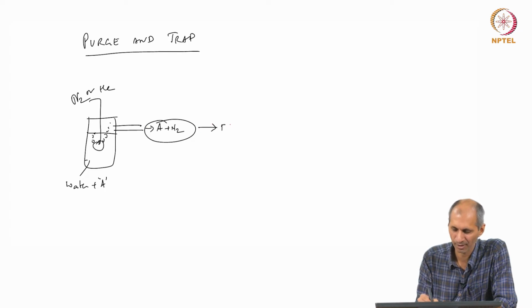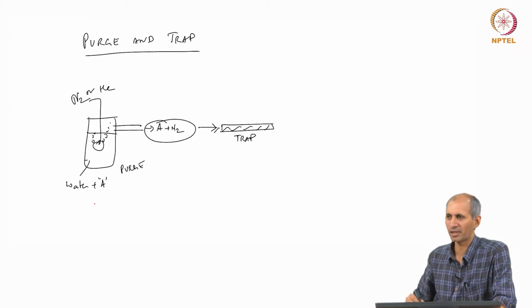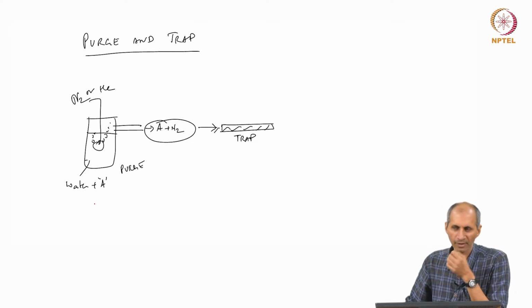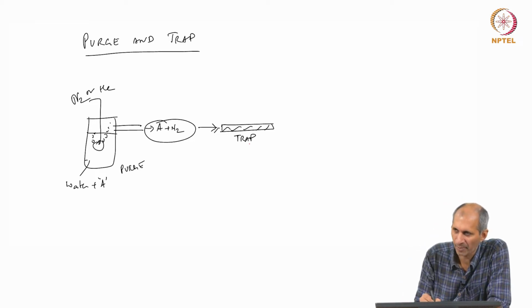Now what do you do? Automated, you put a small thermal desorption tube here. We are doing the adsorption here. It goes in and sits here. This is the trap. This is the purge. We trap it until all of it is purged. You purge it for 15 minutes, 20 minutes, half an hour, whatever time you determine. This is a mass transfer problem. How long you need to purge depends on the concentration, the flow rate of the bubbles, the size of the bubbles and all that. You just purge everything and then you trap it. Once you trap it, the trapping cycle is done.